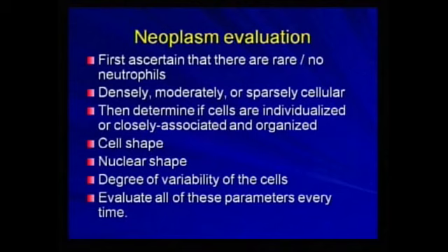The evaluation of these slides starts like every other one. First, you look at the quality and the cellularity of the aspirate. Then you want to make sure that there are no neutrophils.